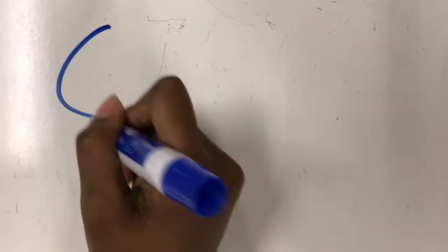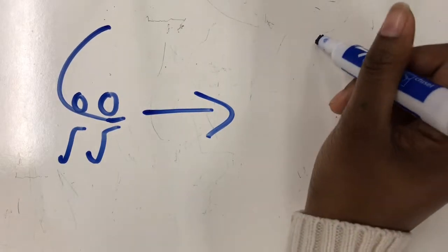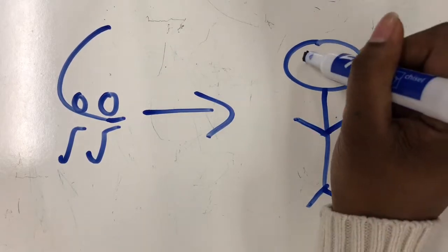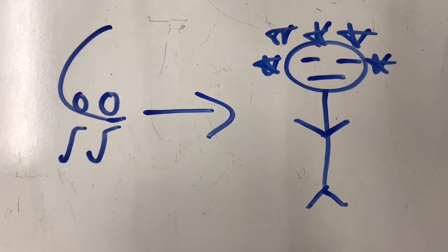Liquid nitrogen is an inert gas, colorless, odorless, non-corrosive, non-flammable, and extremely cold. Although nitrogen is non-toxic and inert, it can act as a simple asphyxiant by displacing the oxygen in the air to levels below that are required to support life. Inhalation of nitrogen in excessive amounts can cause dizziness, nausea, vomiting, loss of consciousness, and death. Death may result from errors in judgment, confusion, and loss of consciousness that prevents self-rescue. At low oxygen concentrations, unconsciousness and death may occur in seconds and without warning.